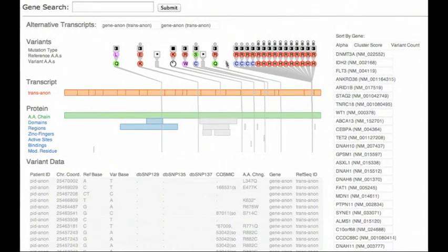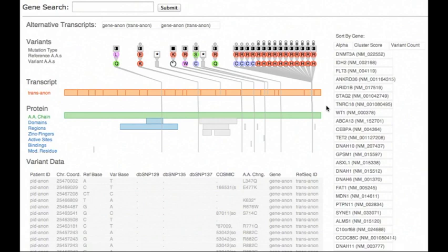The dark gray line indicates where the variant occurs within the gene transcript and associated protein annotations. It's easy to see whether the variant is close to exon boundaries in the orange transcript band or intersects important functional protein annotations in the bottom bands.